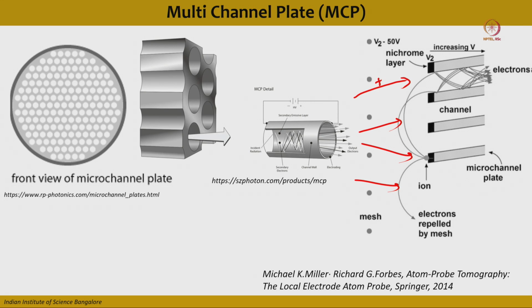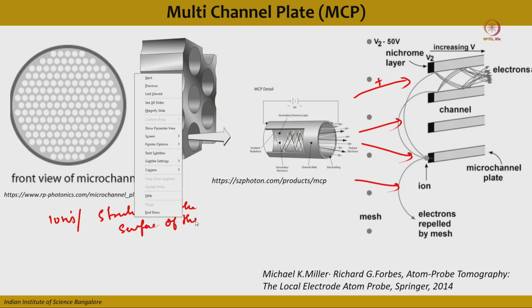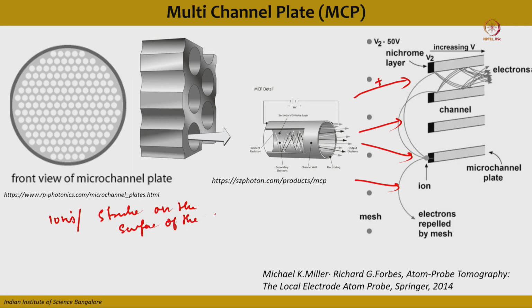These ions will strike the surface of the glass tube, and as you know, this glass tube has a very high surface charge density.